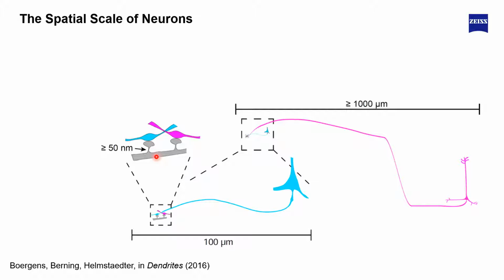If we are thinking about this overview, millimeters, centimeters, even down to the micrometers, we can get away with light microscopy. But the challenge is that we have to detect those very fine structures that make up eventually those connections, right? So we need resolution capabilities of down to sub 50 nanometers. Probably there are even aspects of it that we need to resolve smaller than that. So a couple of dozens of nanometers is what we need and look for.